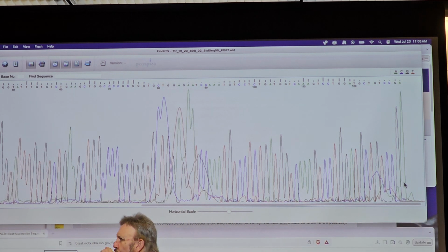If your product is less than 80 base pairs, you'd lose the first 30, so you'd get about 50. I mean, once you get too short, then this kind of sequencing doesn't make sense. So you can't sequence oligos this way, for example. If you've got something 20 or 30 long, you can't sequence it this way.